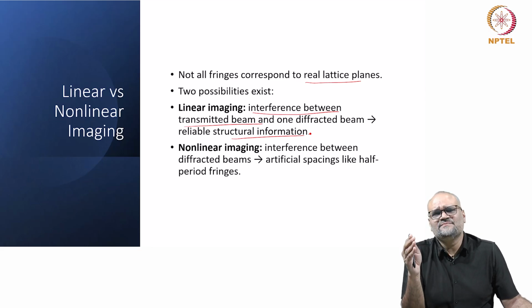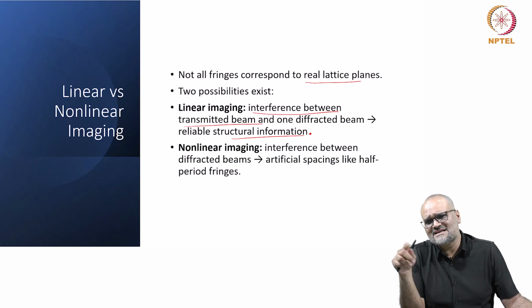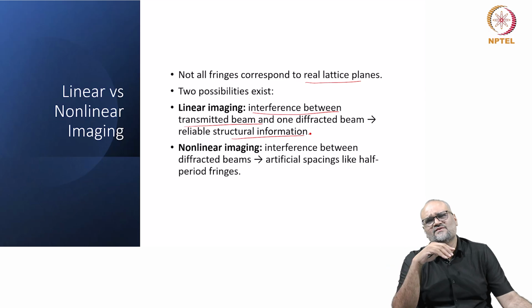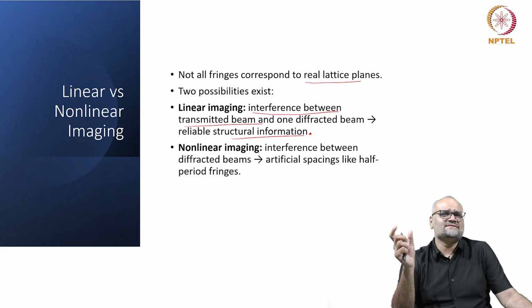This has effects mainly on the delocalization of the information that you are recording, and the contrast also changes. We have seen how the contrast of the object wave changes through the contrast transfer function, which is the sinusoidal part or the imaginary part of the aberration function. And you also have the amplitude contrast transfer function, which I did not introduce earlier, which is the cosine part or the real part of the aberration function.